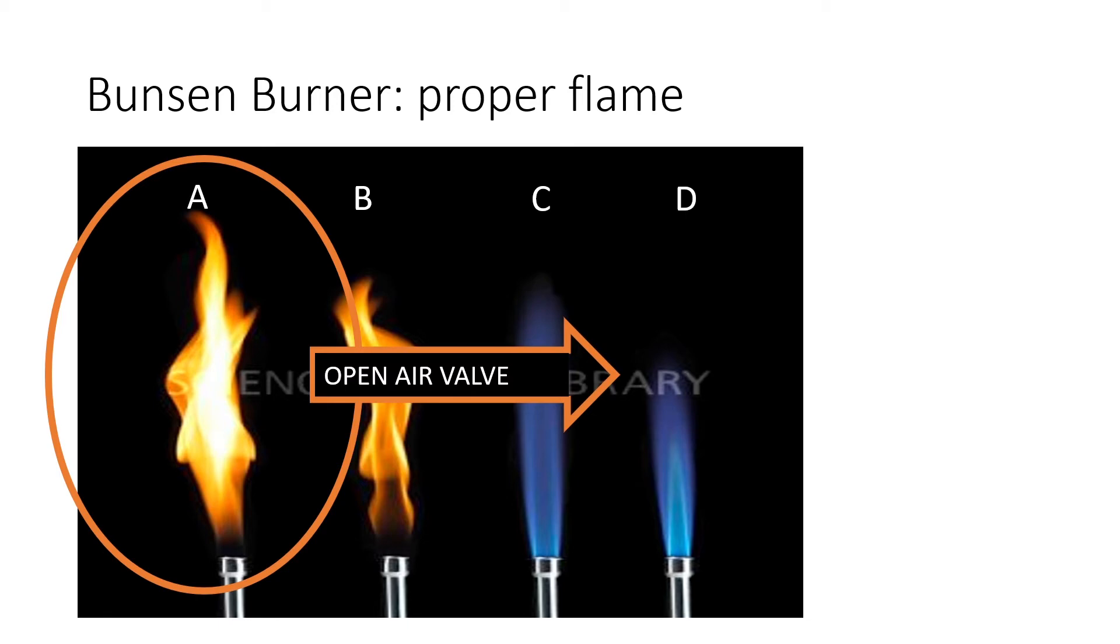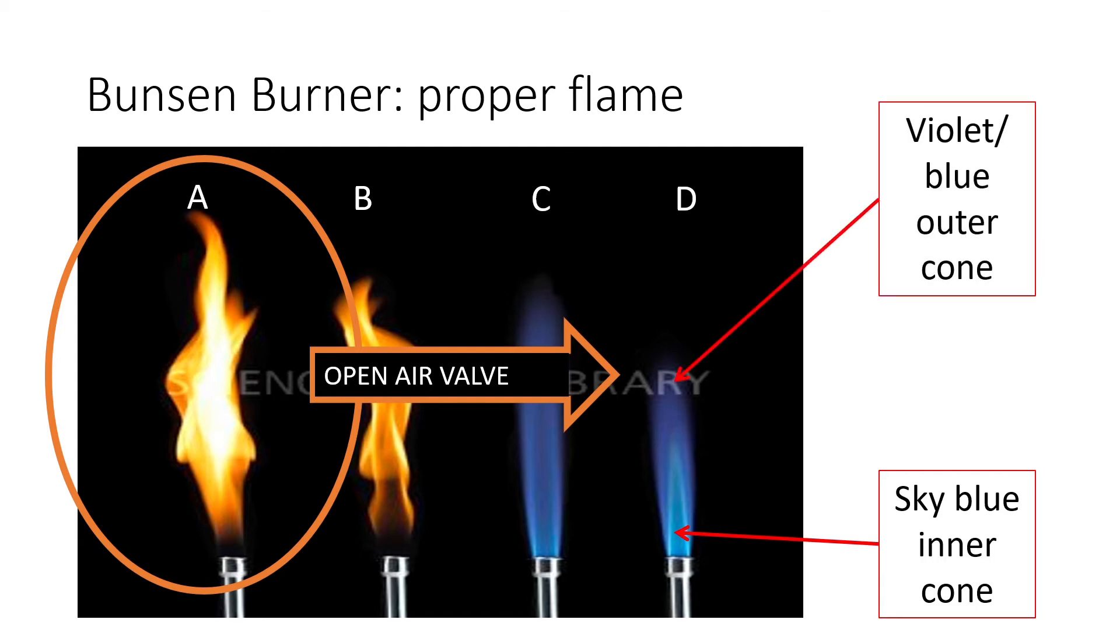To make the flame go from yellow and smoky to blue, we need to open the air valve. That yellow flame indicates that there's not enough air, not enough oxygen coming in for the combustion reaction. Notice also that in a well-formed flame you have a sky blue inner cone and then you have an outer blue-violet cone.